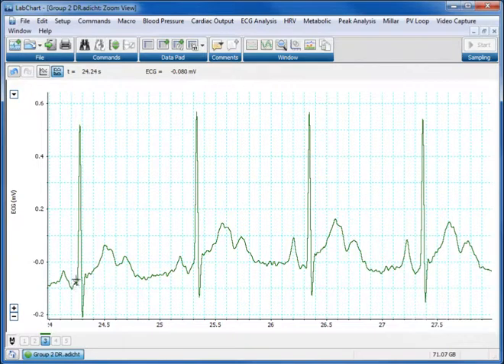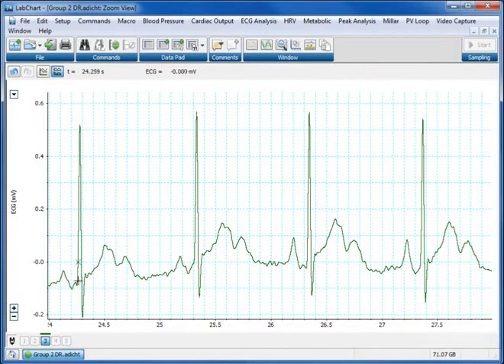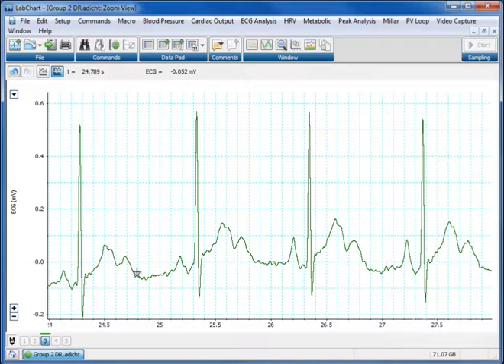We want to measure QT interval which is from the start of the QRS complex to the end of the T wave and we can measure that by holding our cursor over here and making a note of the time, holding our cursor here and making a note of the time. You can see the time is shown where it says T equals.